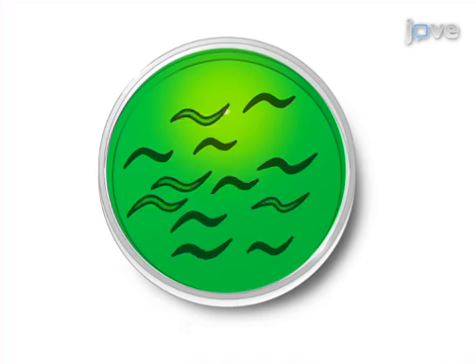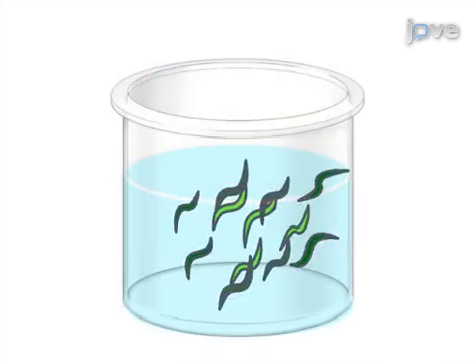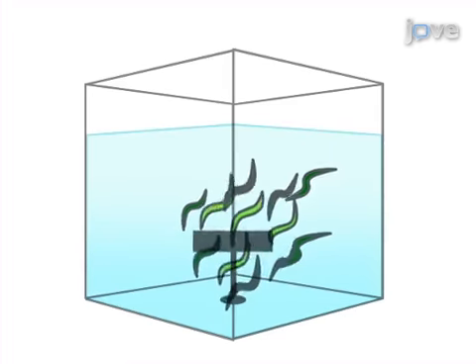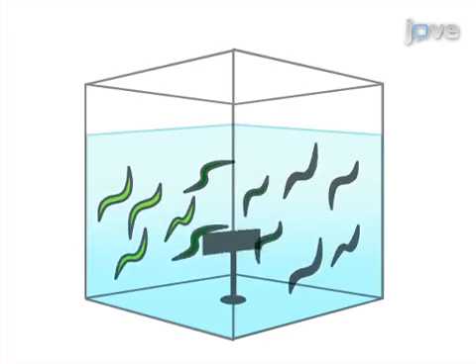pathogen. After washing, the differentially colonized populations of worms are separated into pure populations, focusing on the two extremes of fully colonized and non-colonized worms. Next, RNA is extracted from these populations, and immune gene expression is evaluated in comparison to worms grown on non-pathogenic E. coli in order to examine the relationship between the immune response and colonization.